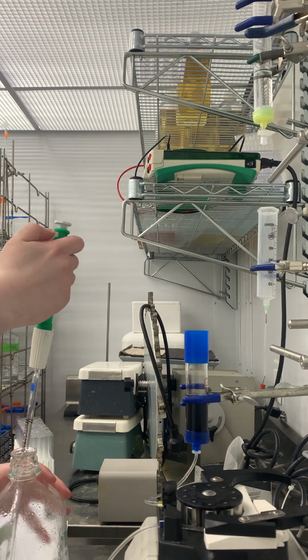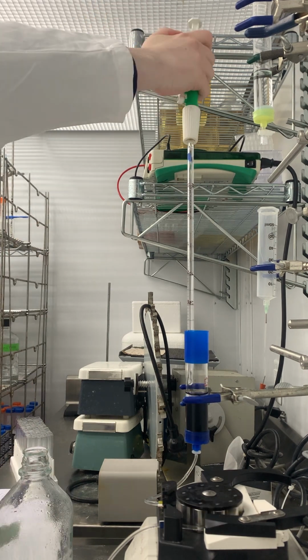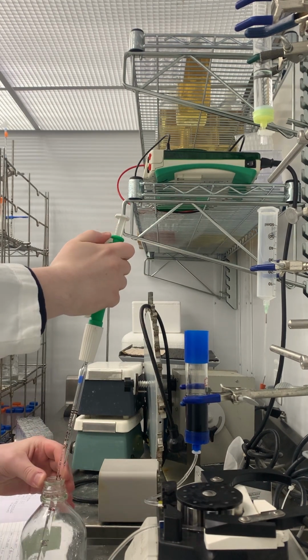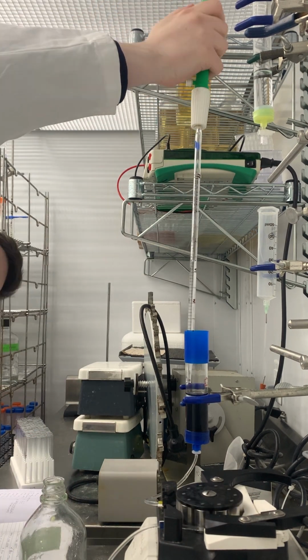A solution with a different concentration of salt is applied to the column to wash out more of the undesired protein. Another solution with a high concentration of salt is applied to the column. This causes the protein we want to unbind from the dye and flow out.